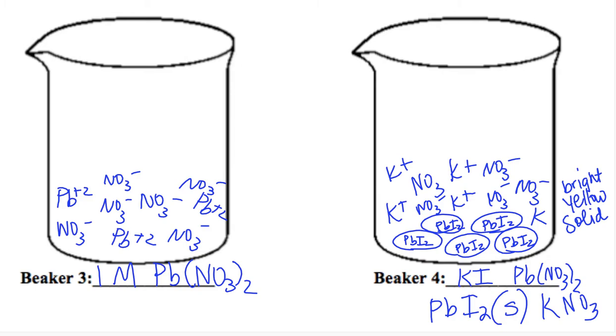So this is DI water, right? We know it doesn't light up, correct? What I'm going to do now, I've got some little PbI2 floating in there now. Cross-contamination. I am going to put in some sugar. Stir it around. Most of it will dissolve, but I put a lot in there and the water's not very warm. So I'm going to get it to dissolve as best I can. So the sugar's dissolving.